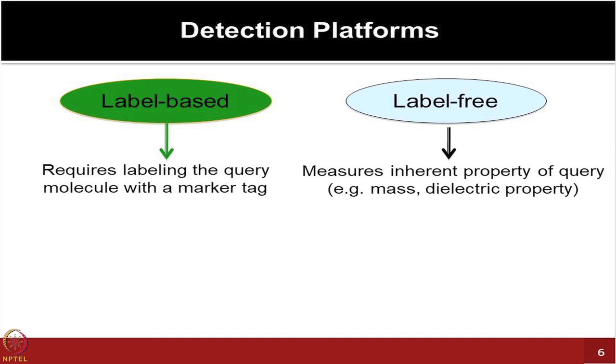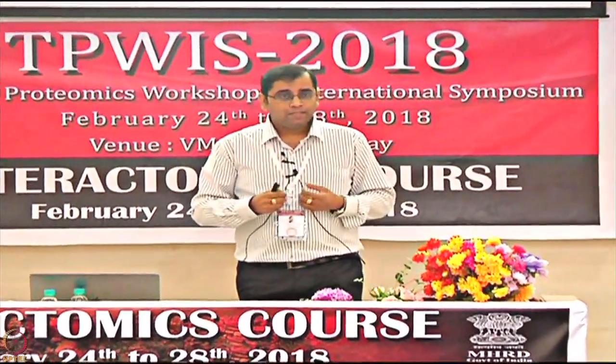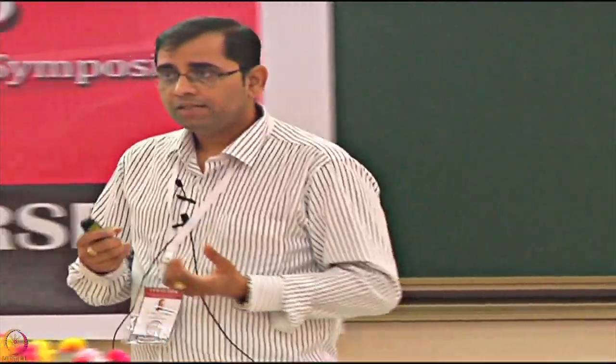As a result, many types of label free platforms have emerged, which essentially aim to look for the properties of the molecule itself. If two molecules are binding, what kind of mass is getting changed, what kind of dielectric properties are getting changed, do we see some sort of percentage reflectivity change because of the binding intensity, can we see some sort of interference change. Many of the physical principles are being used to look at the molecules and molecular interactions, and can we measure those properties.